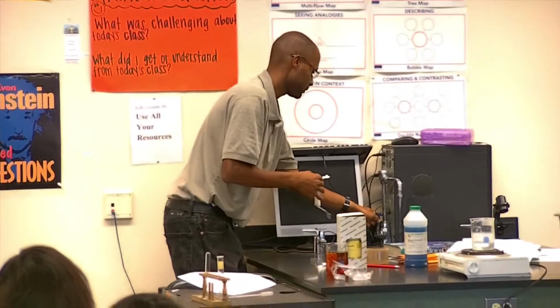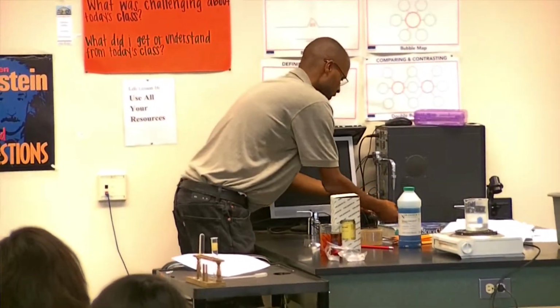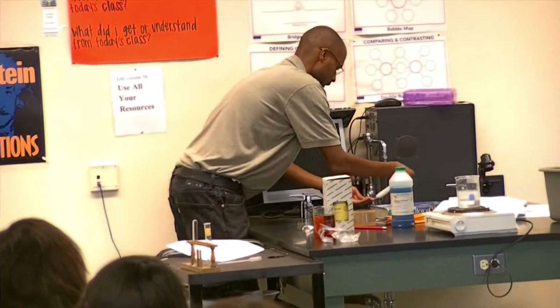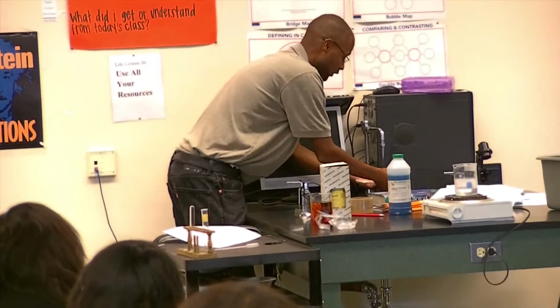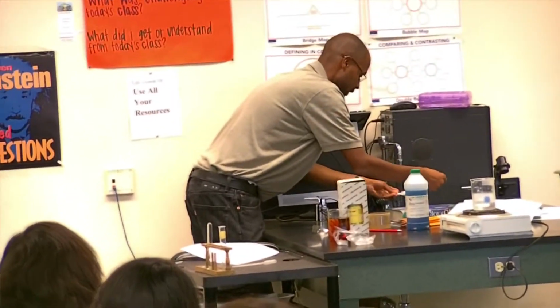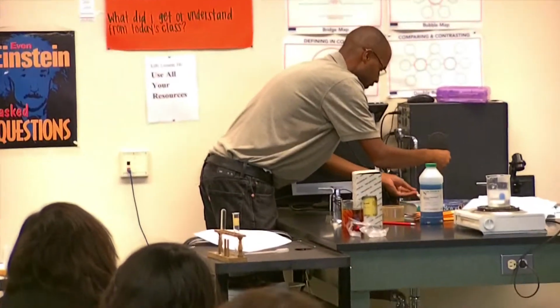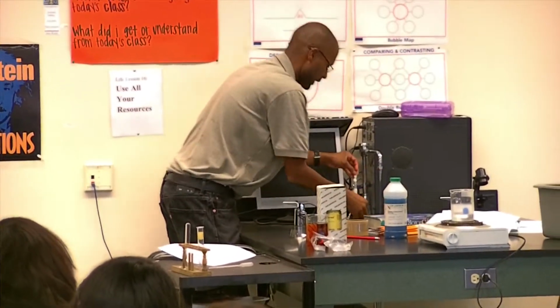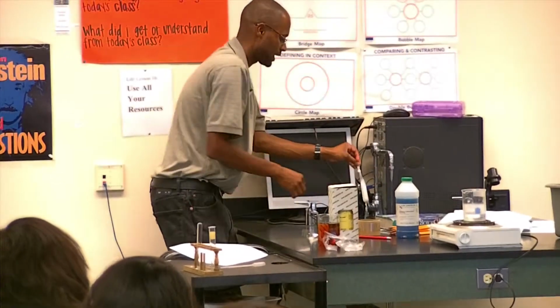I'm going to rinse this off. Why do you think I'm going to rinse this off? So all the excess stuff gets off, right, so there's no leftover material on here at all. Everything is only inside the dialysis tubing. I want to clean it off as well as I can, and at the same time I'm mixing the two substances together.